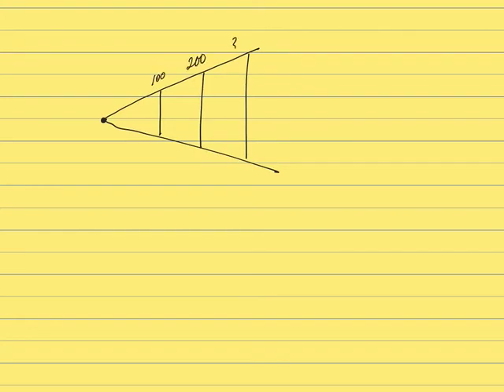Okay, so if we think about the strength of the external magnetic field, we often draw a diagram that looks something like this, where this would be no external magnetic field, and then maybe like 100, 200, 300. So if you've ever learned anything about NMR spectroscopy before, perhaps you've seen this sort of diagram where you have this difference in external magnetic field.